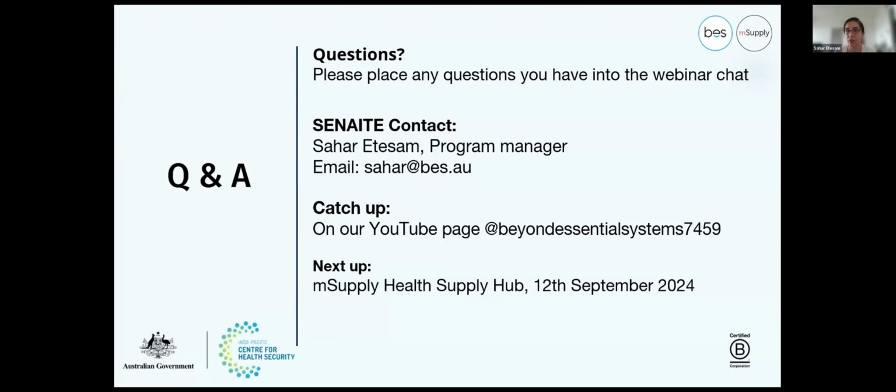I'm going to go to the first question that Tessa asked. I think Mark nicely answered that question in the chat. And yes, SENAITE can actually connect to any analyzers. For your second question, interfacing with the epicenter, we're actually going to do that in Goroka for the first time. And we believe it is actually possible to do that connectivity as well for the MIC values from the Phoenix.